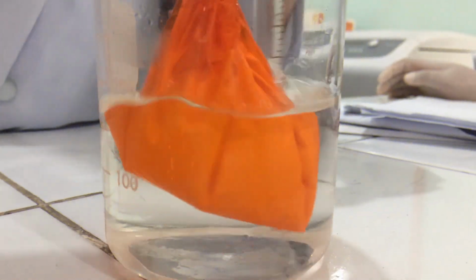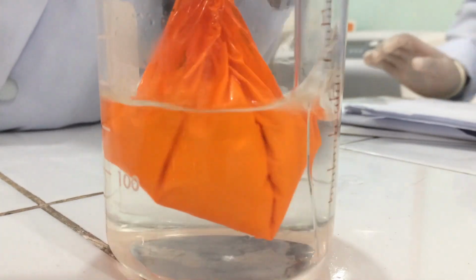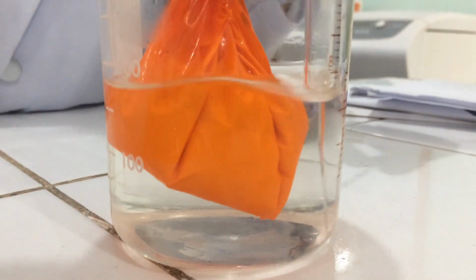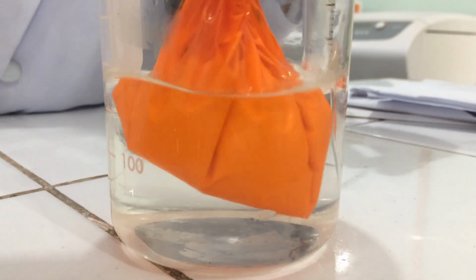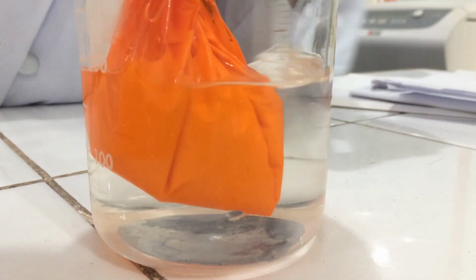For 1 hour, stir the water outside the milk and let the milk dialyze. Dialysis is undergoing if the water outside the milk is turning colloidal or turning white in appearance. After 1 hour, collect the dialysate. Let us test for the presence of proteins and sugar in the dialysate.